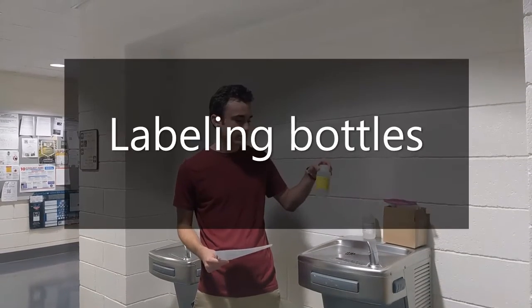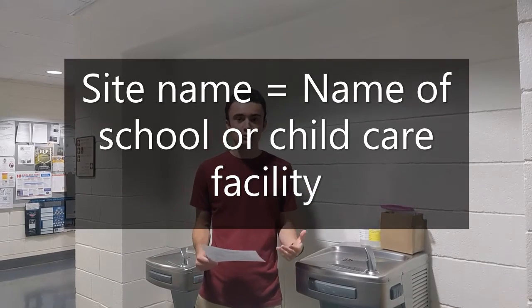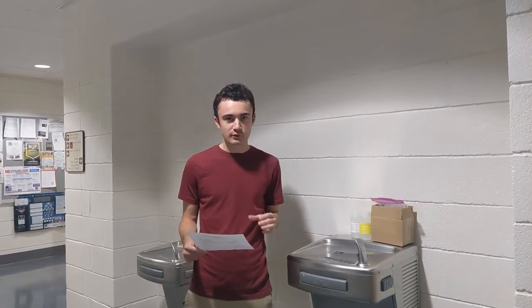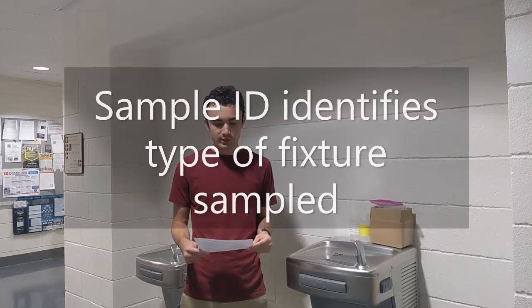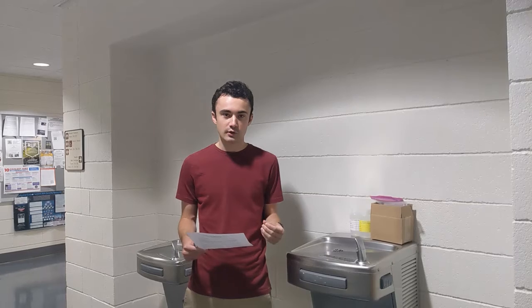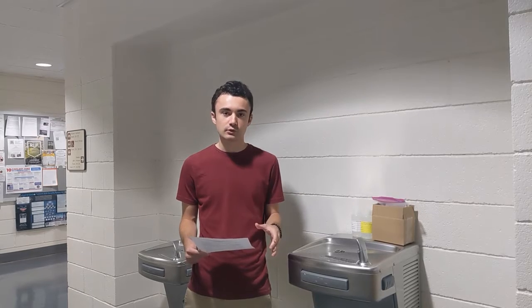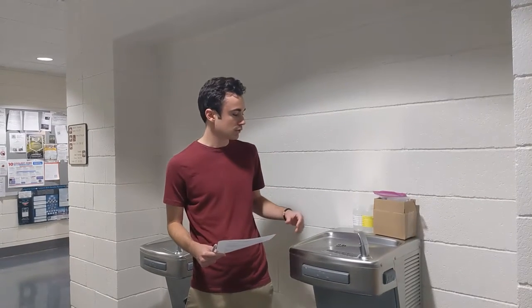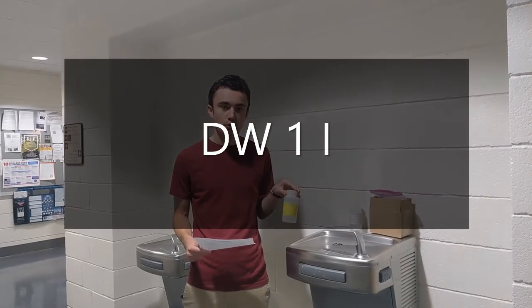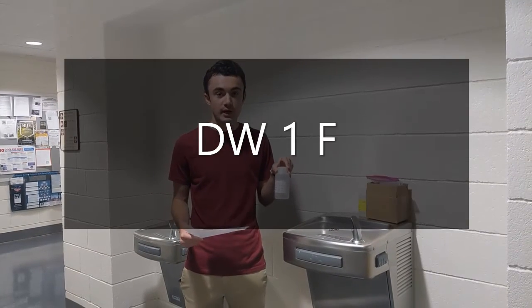Now you'll need to fill out the labels on each of the bottles. For the site name, just list the name of the school or childcare facility. For sample ID, each sample will have a unique ID, and this is made by listing the type of fixture that is being sampled, the number fixture that this is in your facility, and either I or F for initial or final sample. For example, since this is a drinking water fountain, this sample would be labeled DW1 and I for initial, whereas this one would be DW1 and F for flushed.